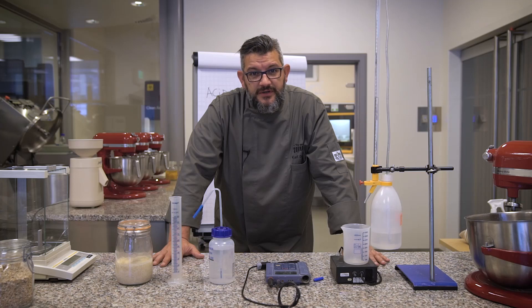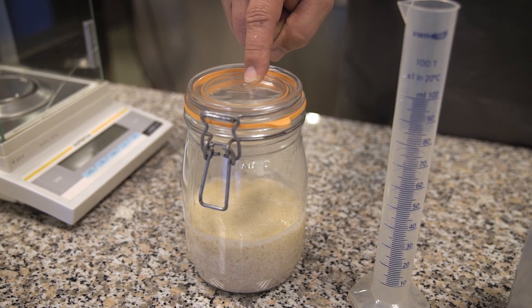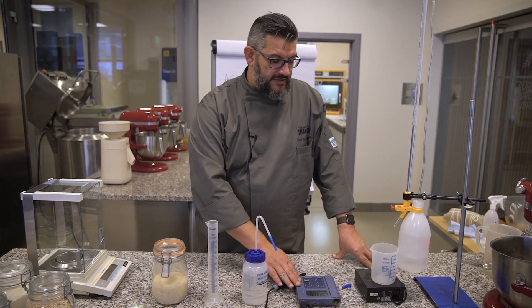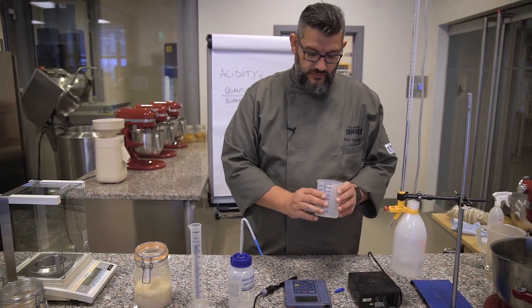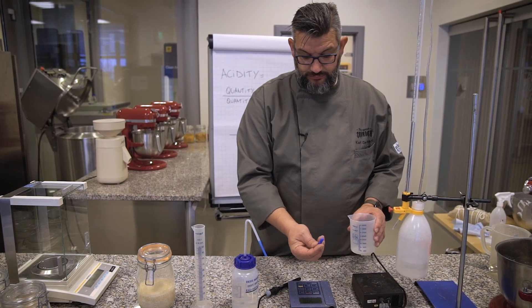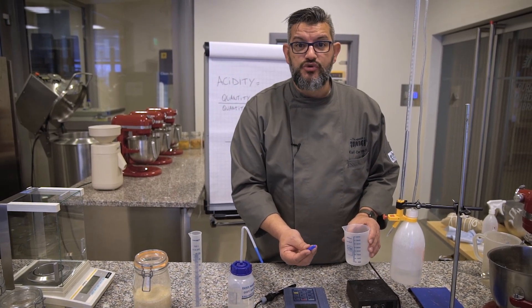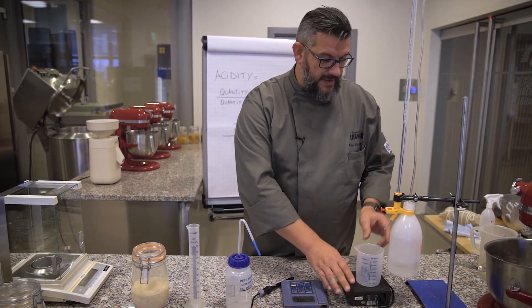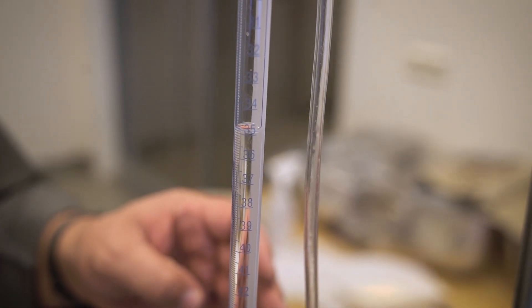This is what you need when you want to measure the TTA: a very precise scale, the sourdough we are going to measure, a measuring unit, some distilled water, a pH meter, a jar or cup or beaker to do the measurement. This is a magnetic stirrer — in French we call it a 'flea' — and here we have some sodium hydroxide at a dilution of 0.1 molar.